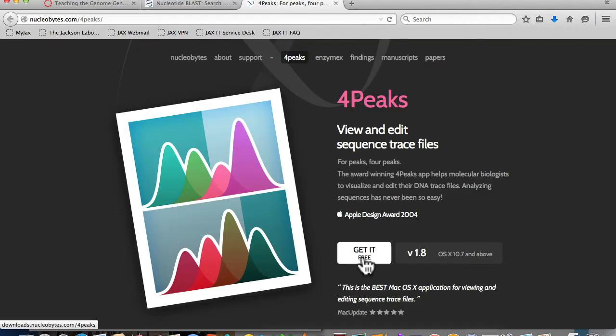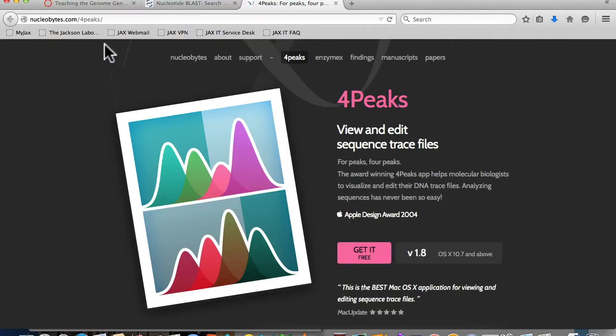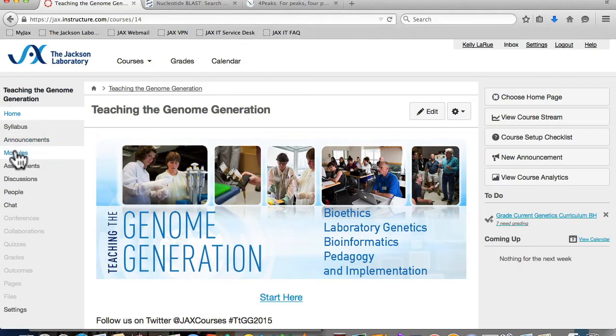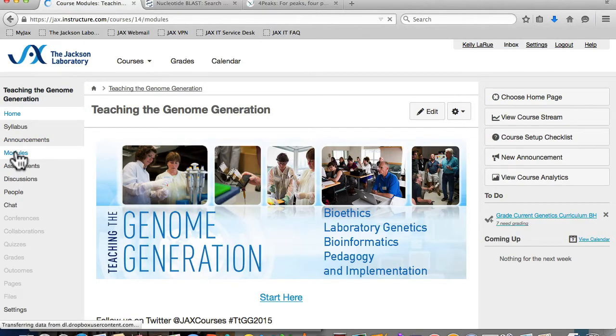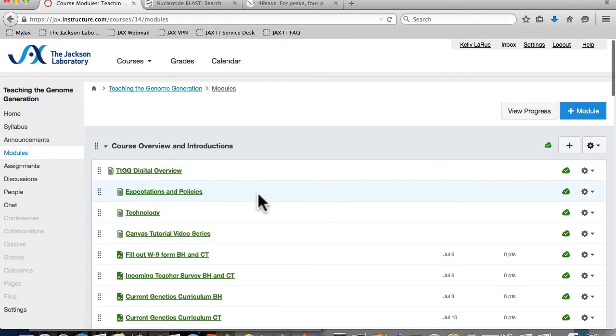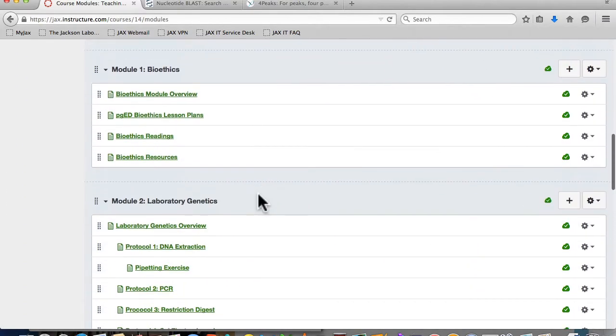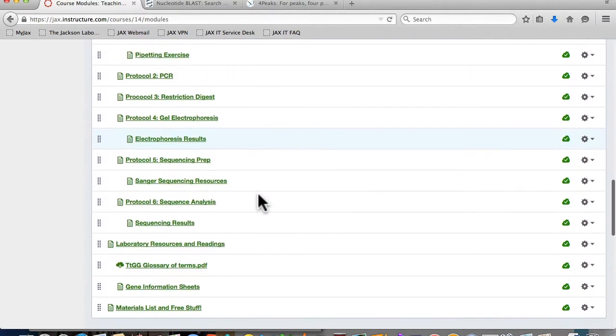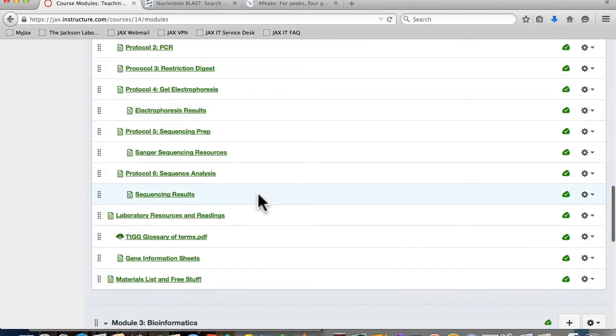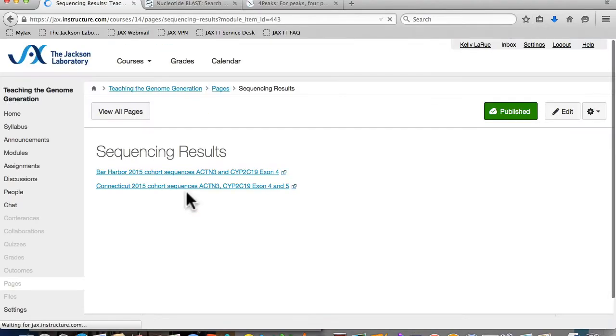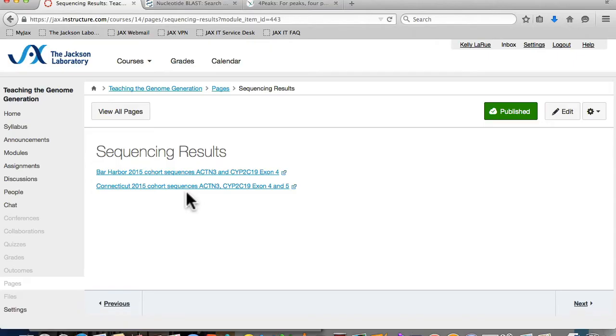Next, you need to download the sequence data. We will distribute your class's data using the Canvas platform. Navigate to the modules tab and scroll to the laboratory module. Within the module, there will be a page called Sequencing Results.